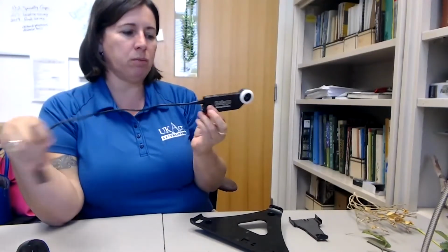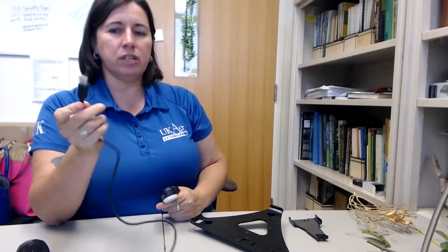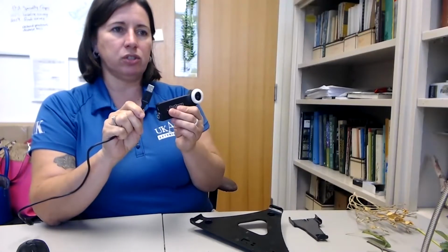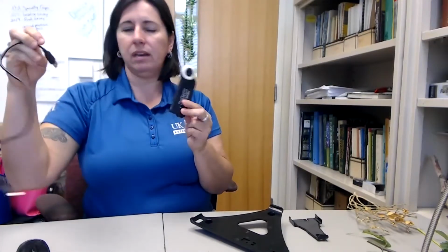Okay, so now one of my favorite tools is what we call a ProScope. Your ProScope, again, is an LED microscope. It's portable. It's got the USB plug to charge it up. It doesn't require batteries. It just charges. Mine stays plugged into my computer, and when I need it, I just unplug it and take it away.